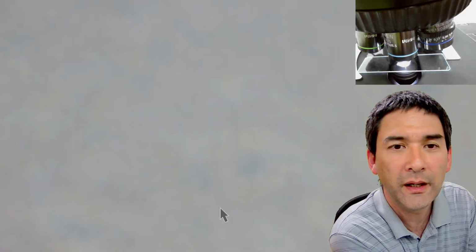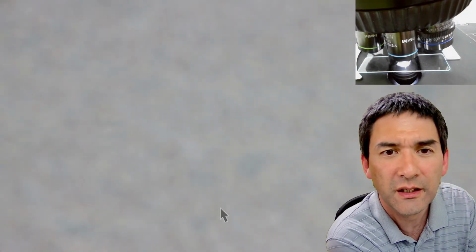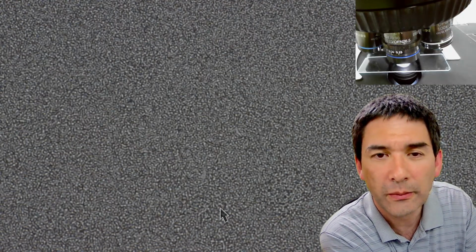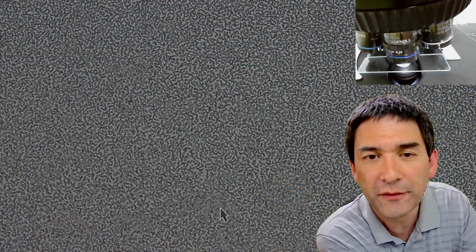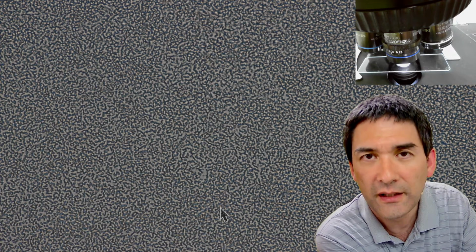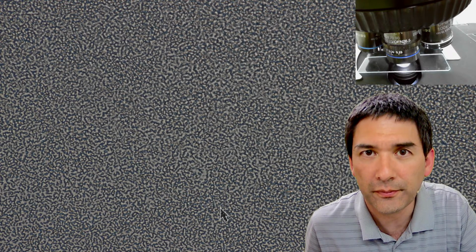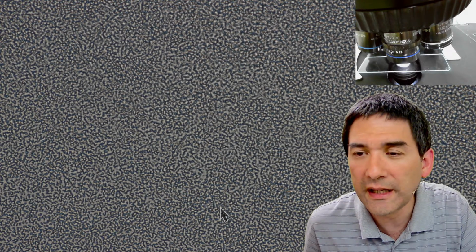And the question is, why are you able to see those non-stained bacteria? Bacteria are transparent, most of them. And the reason is because of differences in refractive index. And if you've got phase contrast, then you're able to see them even better.